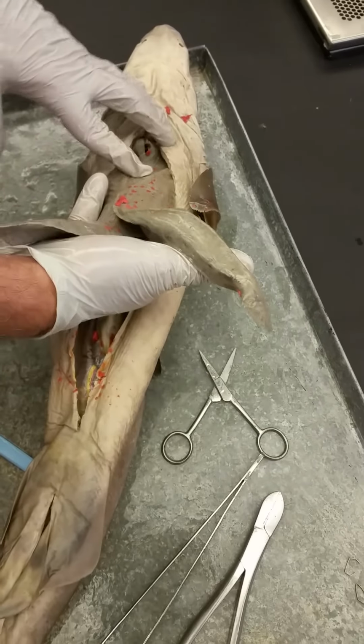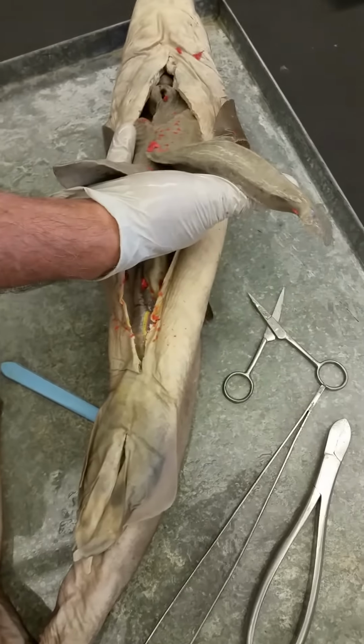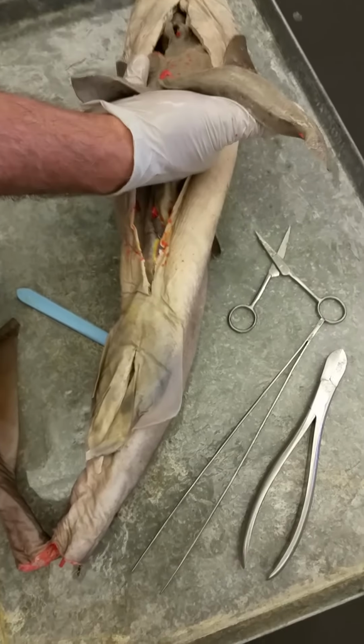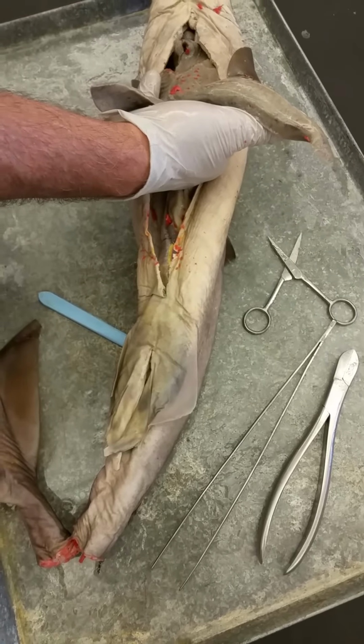It's also their buoyancy organ. In the bony fish, what was the buoyancy organ? The swim bladder, right, which they can inflate and deflate with gas. So the advantage of a swim bladder is you can change buoyancy by changing how much gas is in there. The problem with it is what happens when you change depth and you have a gas-filled bladder.